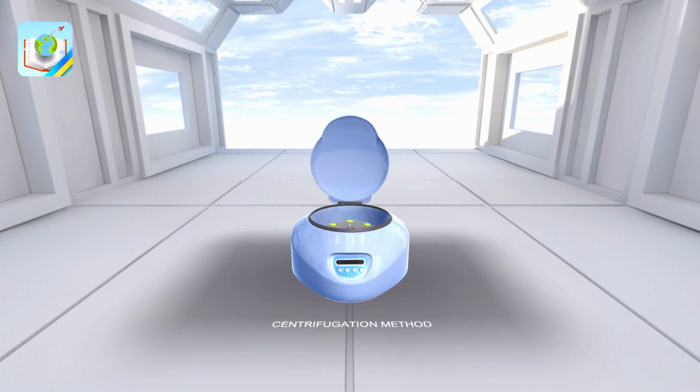Centrifugation is used to separate the sediment from the solution and contaminated liquids. It is also used in the centrifugation of emulsion, for example, the separation of milk. Centrifugation of concrete is used to reinforce its strength. Ultracentrifuges are used to study high molecular weight compounds and biological systems. Centrifugation is used in the chemical, nuclear, food, and oil industries.